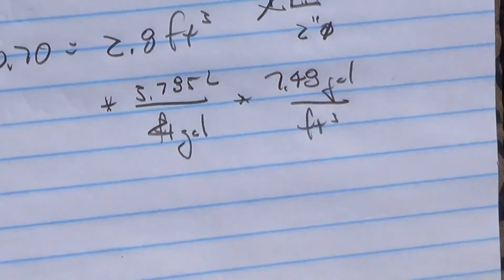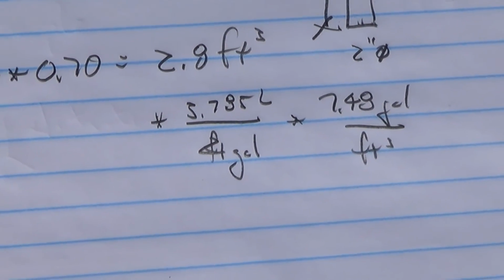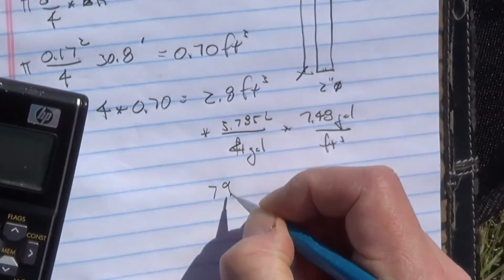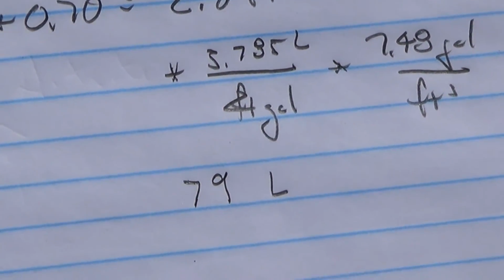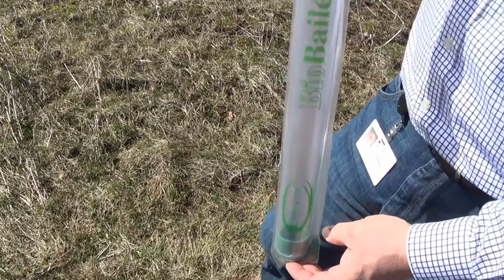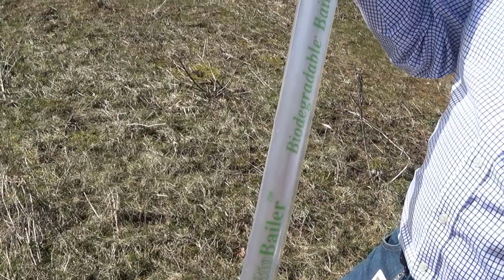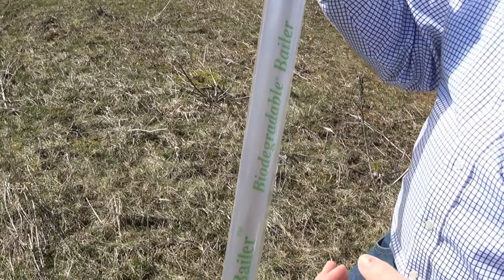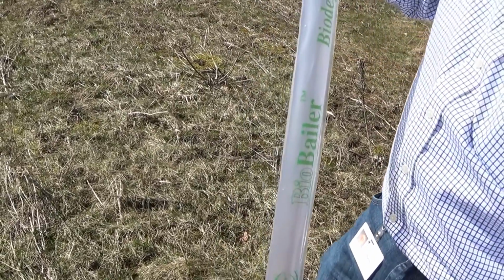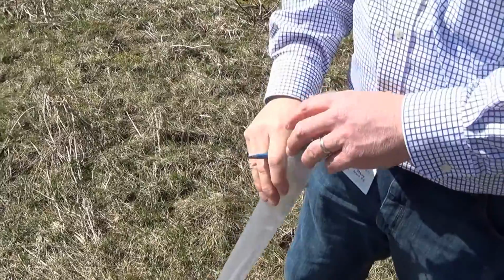So this is liters. So how many liters do we have? 2.8 feet cubed is the same as 79 liters. So technically, if this were our method of bailing, we would have to evacuate 79 of these bales before we recovered a sample. Generally, if you're doing a lot of groundwater sampling, you'd lower a submersible pump in and let that do the bailing. But I'll demonstrate the use of the bailer and how to recover the sample. So let me get that ready.